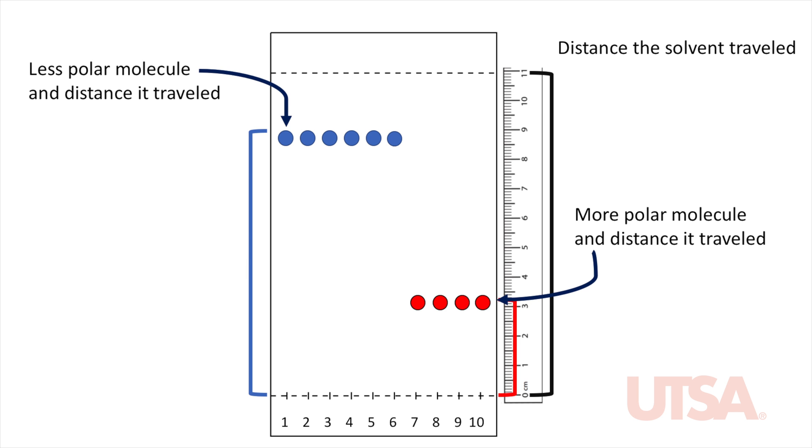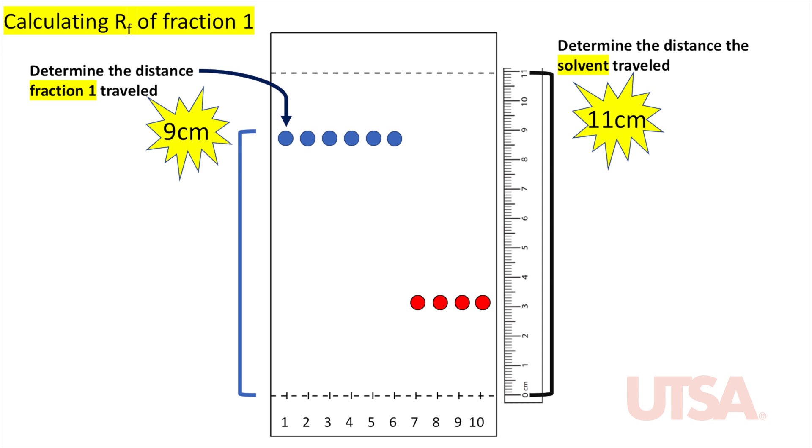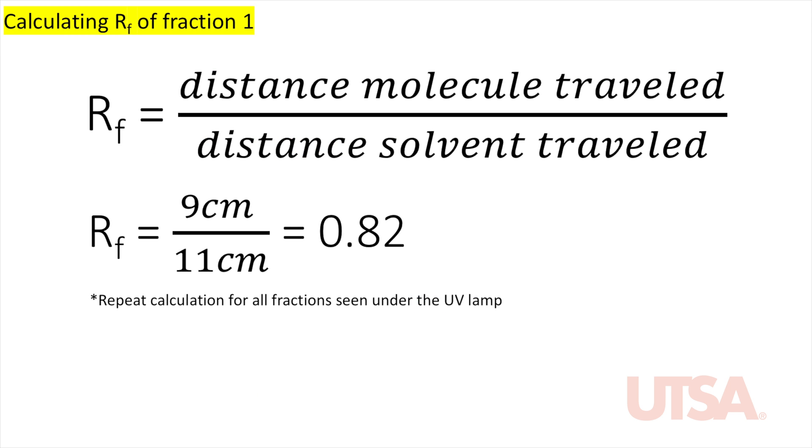Once you've spotted your fractions onto the TLC plate, move the developing chamber to the UV lamp. You will need to quickly place your plate under the lamp and circle your fraction spots. Use a ruler to measure the distance that the solvent and the fractions have traveled. For each fraction, calculate the retention factor RF using this formula. RF equals distance the molecule traveled divided by distance the solvent traveled. Repeat the calculation for all fractions seen under the UV lamp.